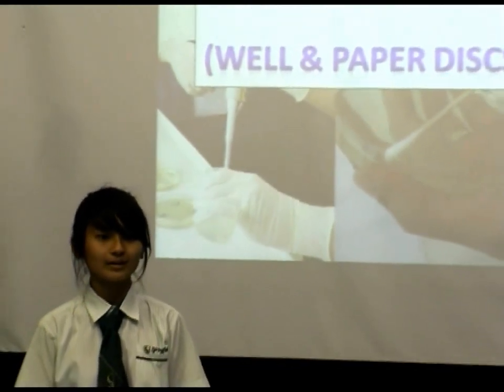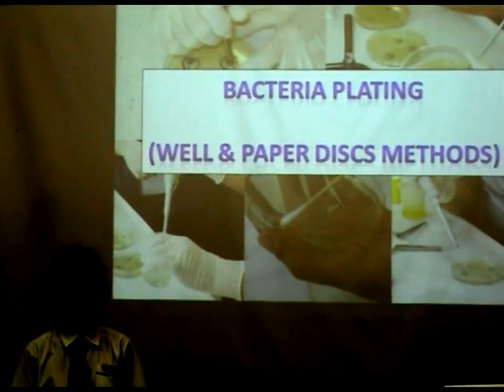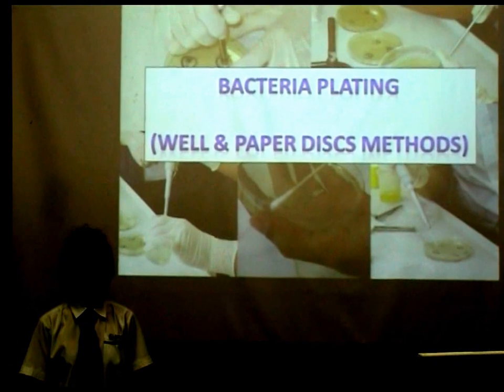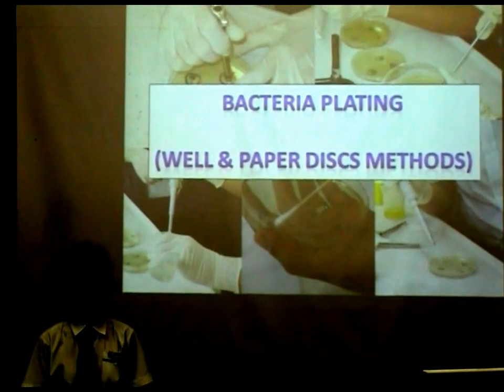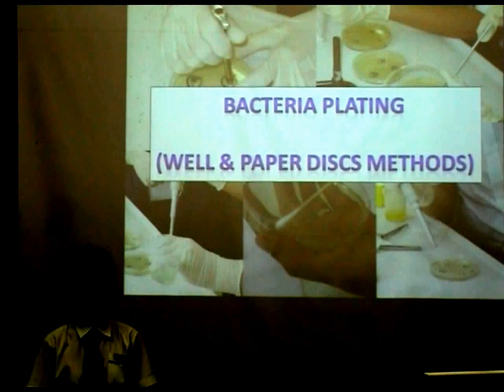Cylinders of agar were cut out, and the agar plugs were removed to create wells in the agar. The first agar plate had 4 wells, control and test subjects 1, 2, and 3. The second agar plate had 3 wells, control and test subjects 4 and 5. All wells were labeled accordingly on the bottom side of the agar plate.